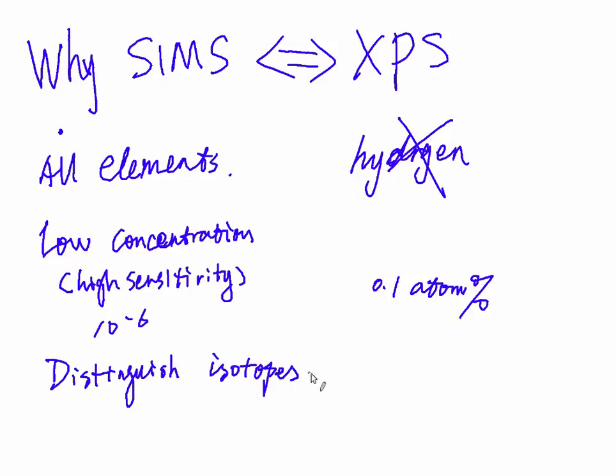The fourth is that SIMS can do depth profiling, while XPS can only detect the surface.